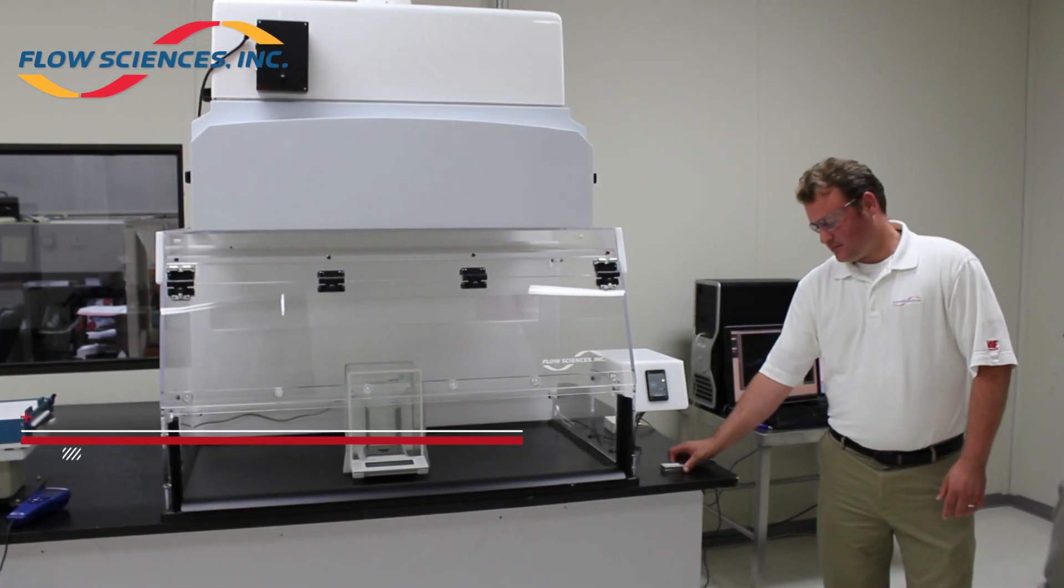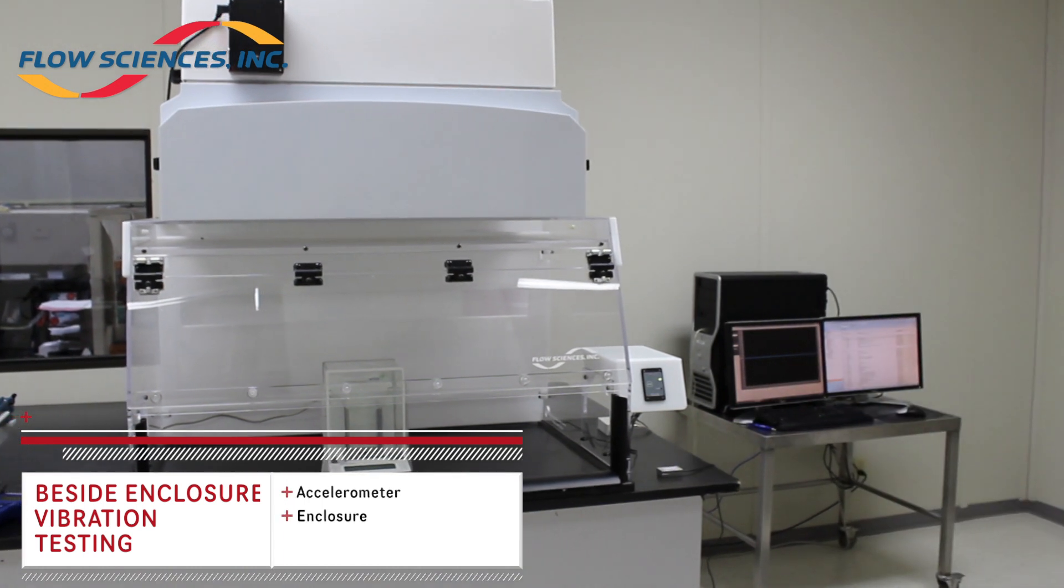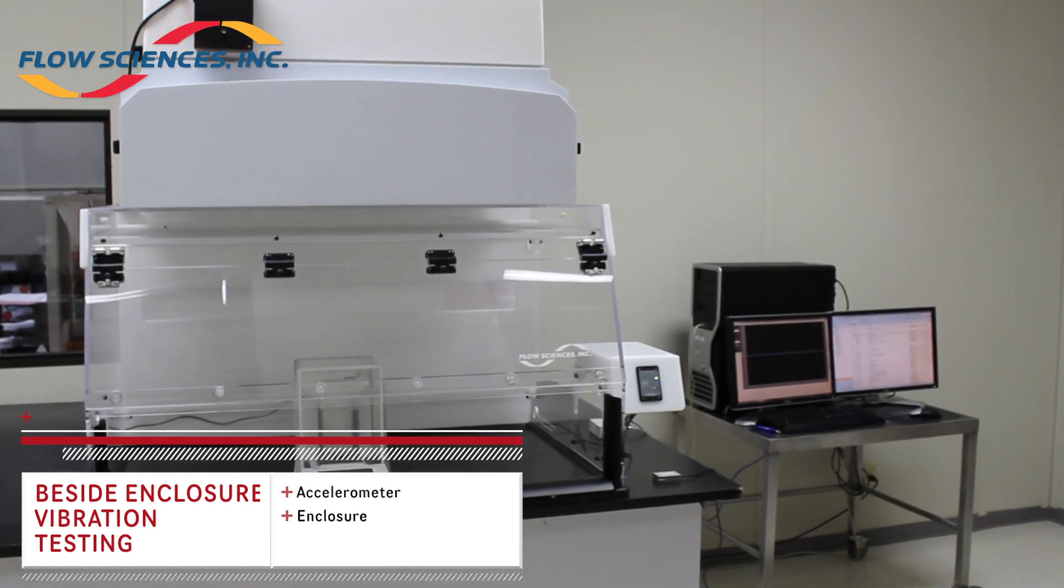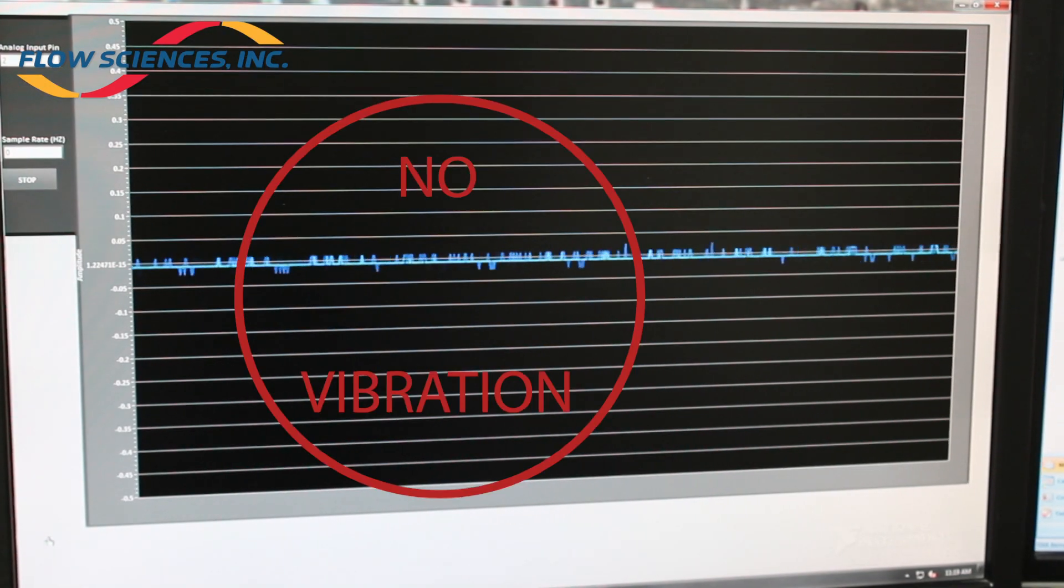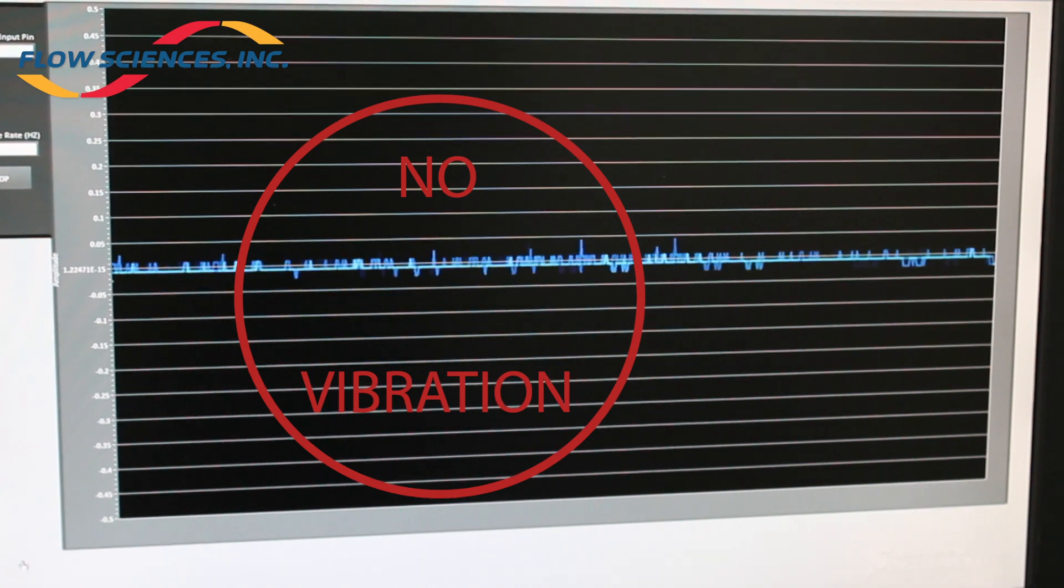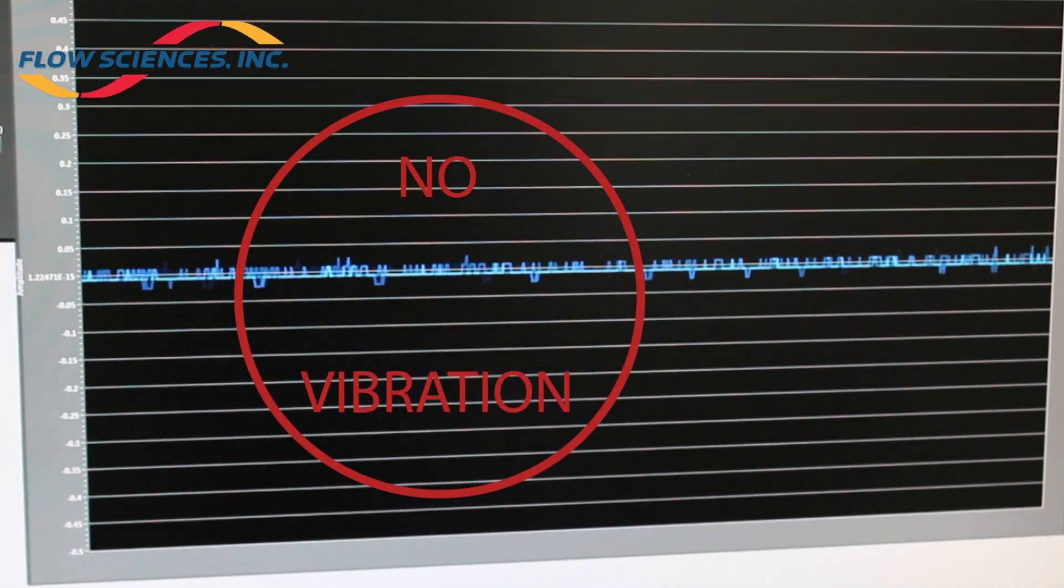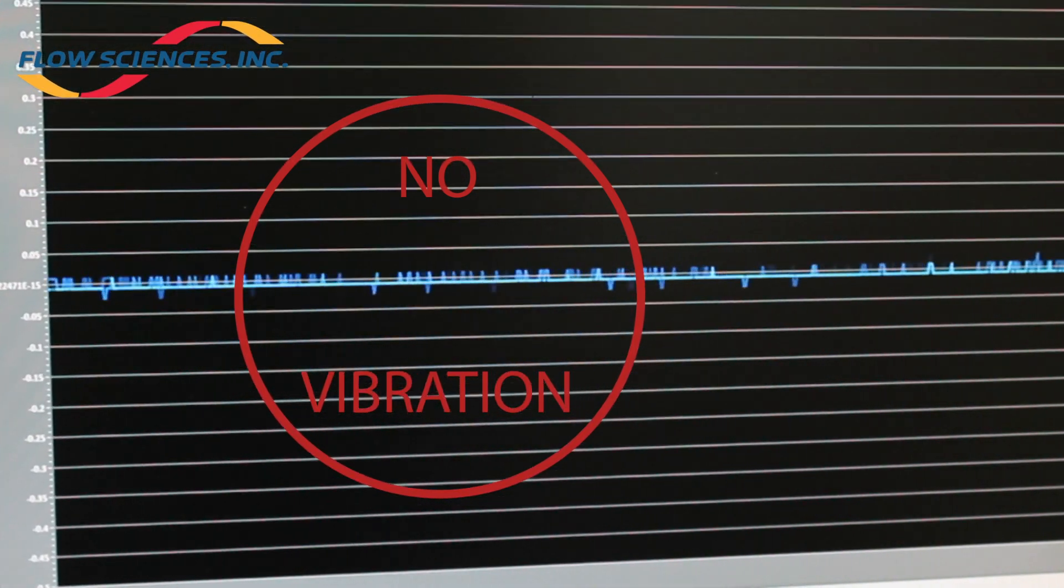Test 4: With the fan still set at a standard operating face velocity, the sensor was placed beside the enclosure centered on the benchtop work surface. This was to determine what vibrations travel through the enclosure from the fan unit onto the actual benchtop work surface.